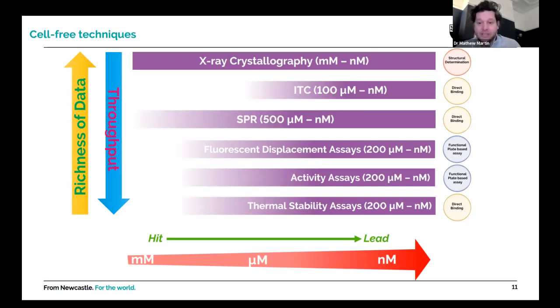But that being said, there are a number of techniques that you can work up to validate your hit. At this stage, I always advise to be pragmatic and not be afraid to dabble in a good few techniques that may belong to the same category, as you will find that one of the techniques may be useful now to validate your hit and breathe some confidence into the program, but may longer term not be used as part of the formalized make-test cascade.